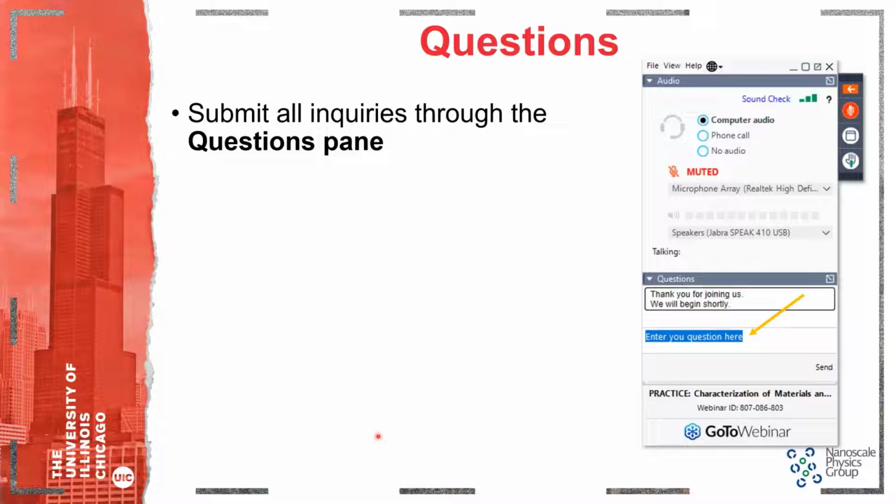Yeah, so the basic analysis is based on Py4D-STEM and pymatgen. We have very good crystallographic structure information in pymatgen that is based on Materials Project. So we can get crystallographic information from there, and then using those simulated structures, we can match the phases that we see in our data, and then use Py4D-STEM to do Bragg vector selection, selecting the appropriate peaks in the reciprocal space. We can measure strain using those.